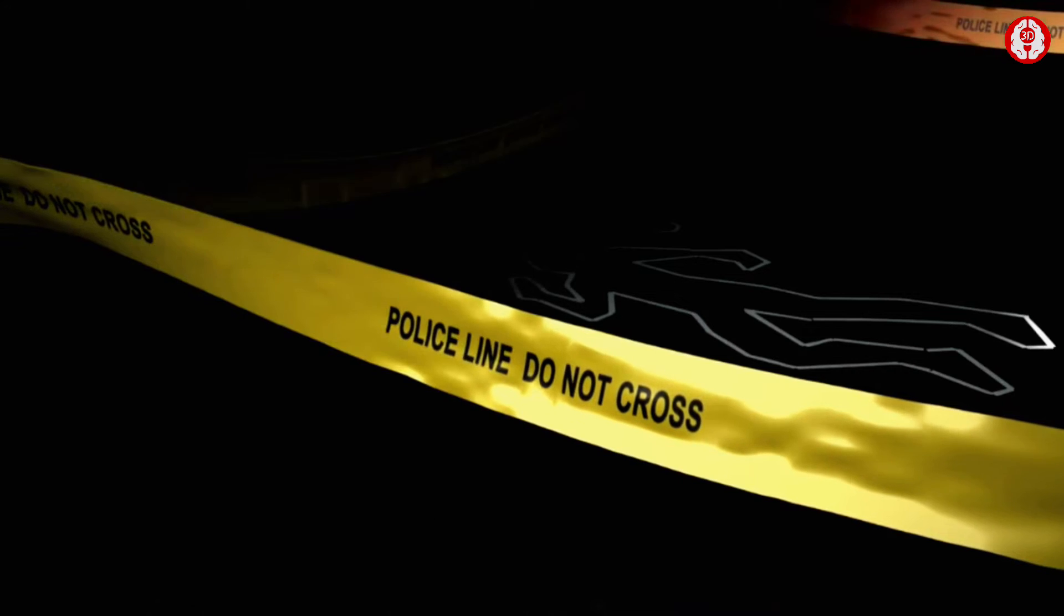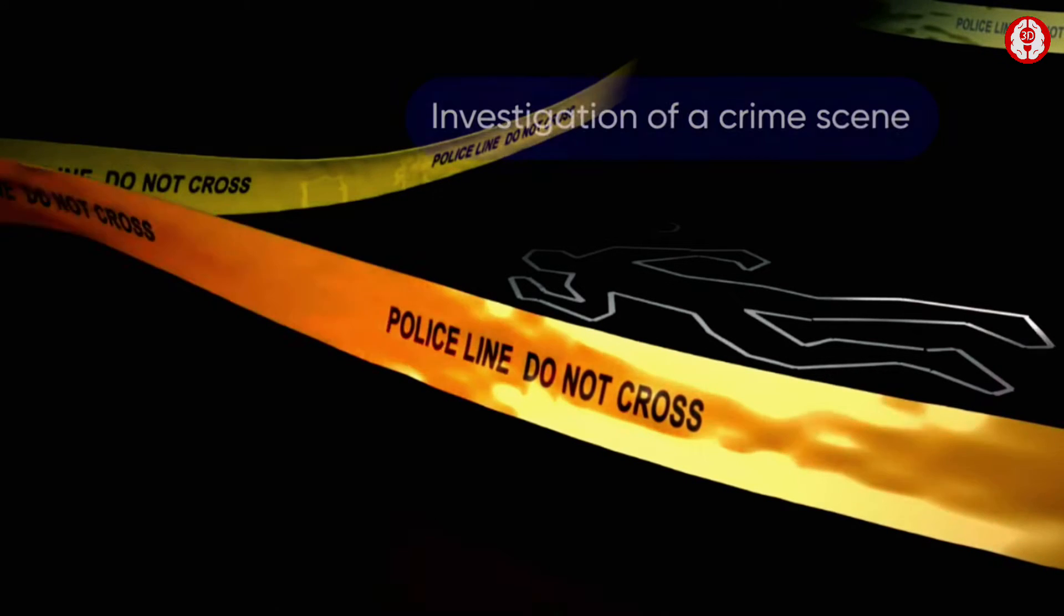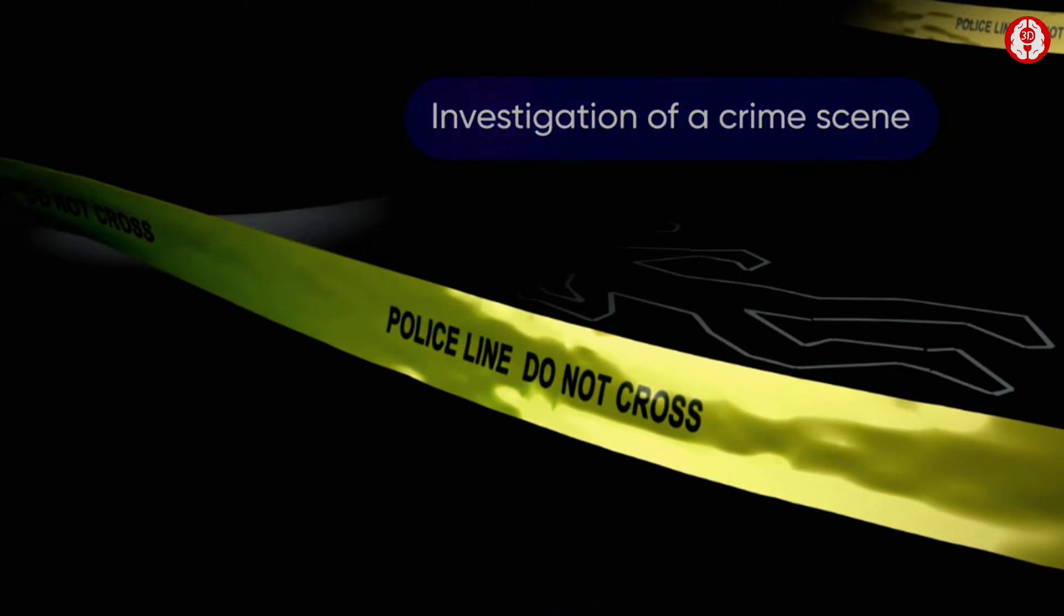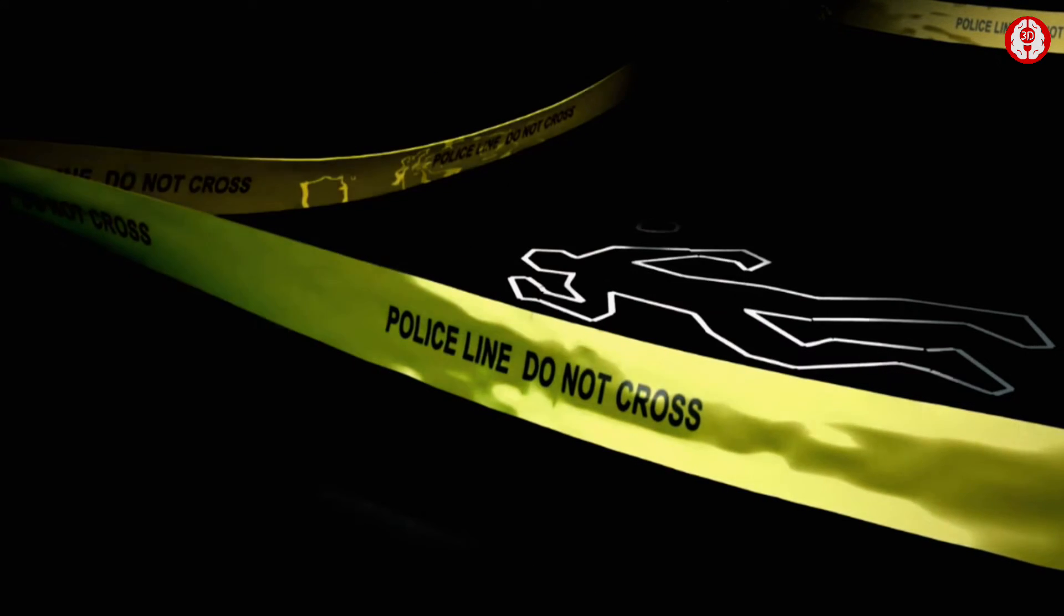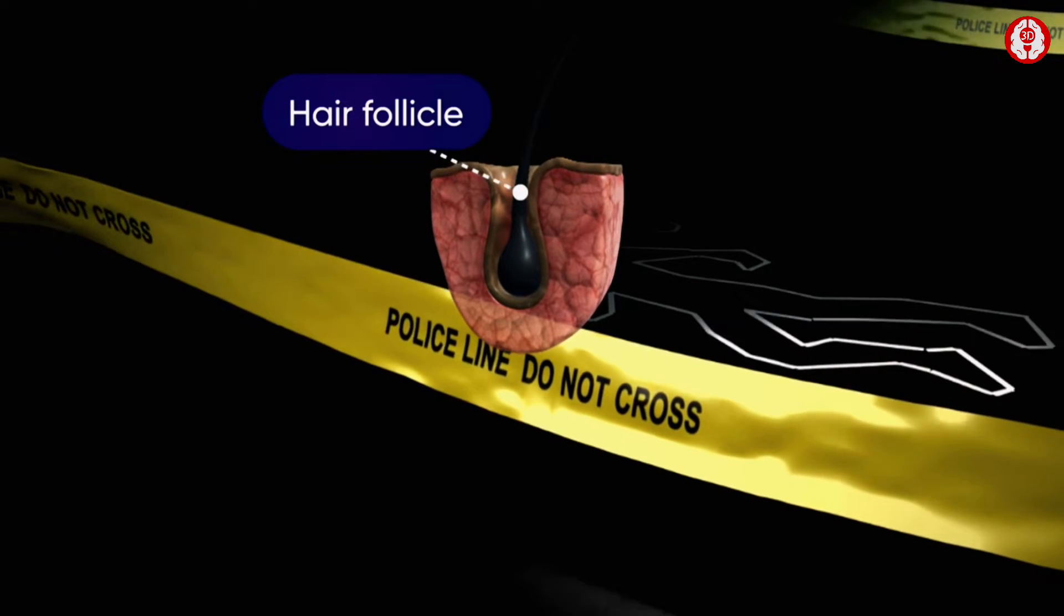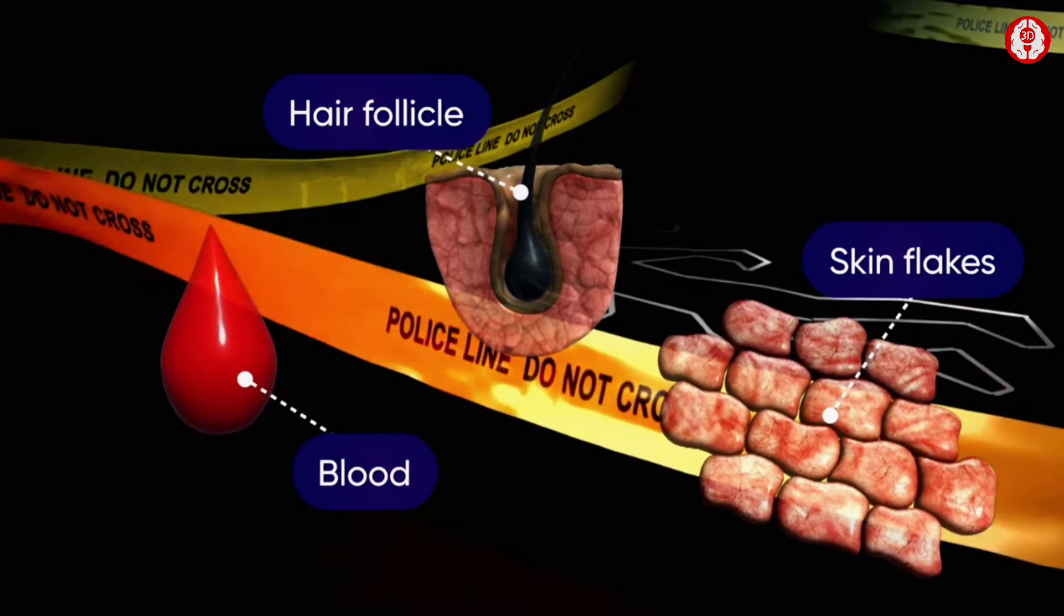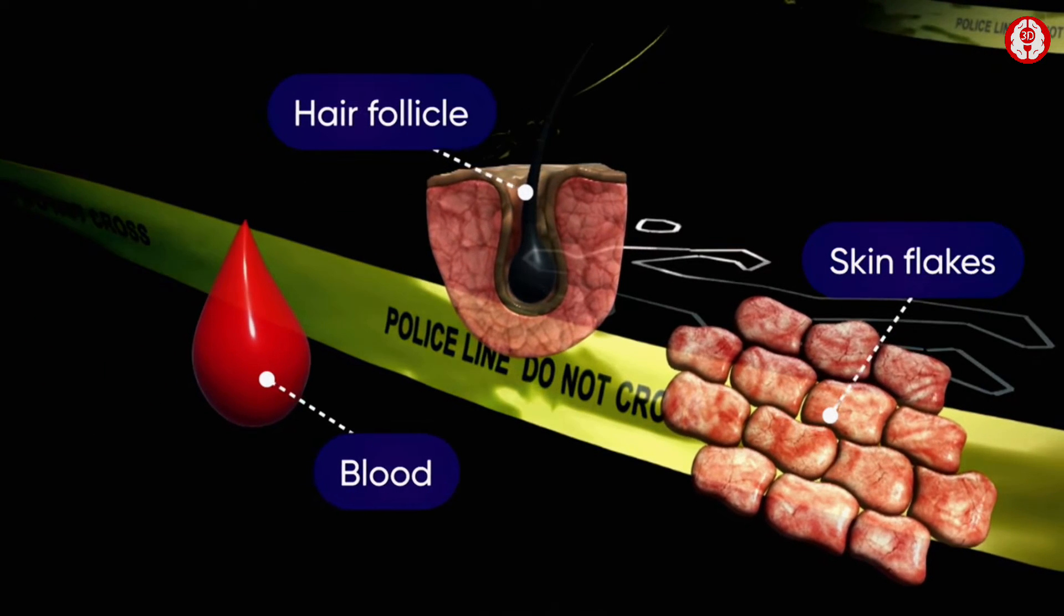Let us learn about the principle and technique of DNA through the investigation of a crime scene. But what are they looking for? There is evidence left behind by the perpetrator like hair follicle, saliva, semen, skin flakes or blood, where cells with nuclei can be isolated.